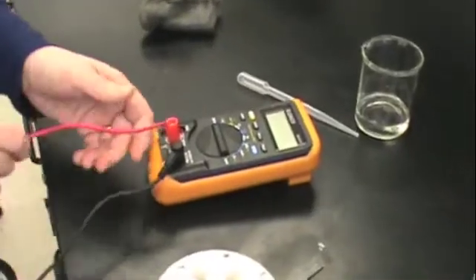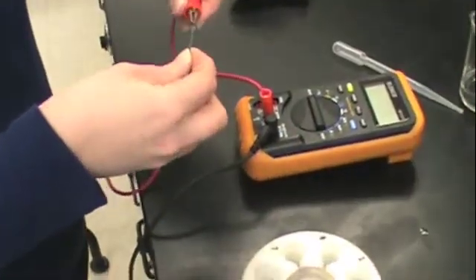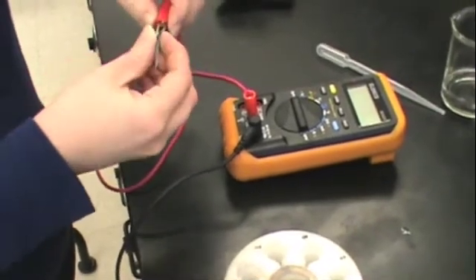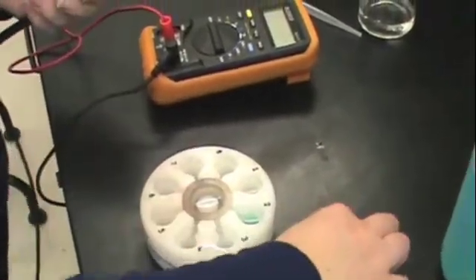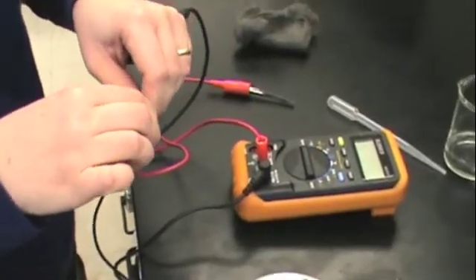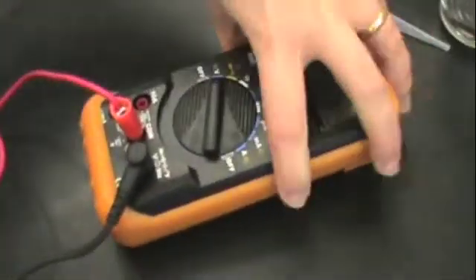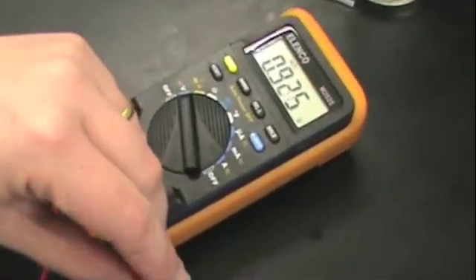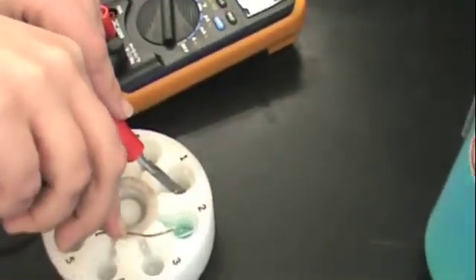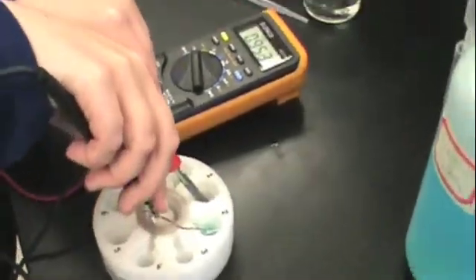Using the voltmeter you obtained from the stockroom, connect a lead to each piece of metal and make a tight connection between the alligator clips and the metal pieces. Turn on the voltmeter to read voltage — that is the V on the voltmeter. Then immerse the metal pieces in their corresponding solutions: copper in the copper solution and zinc in the zinc solution. You should read a voltage of about 0.93 to 0.95 volts. Make sure that you keep your electrodes steady so that you get an accurate reading.